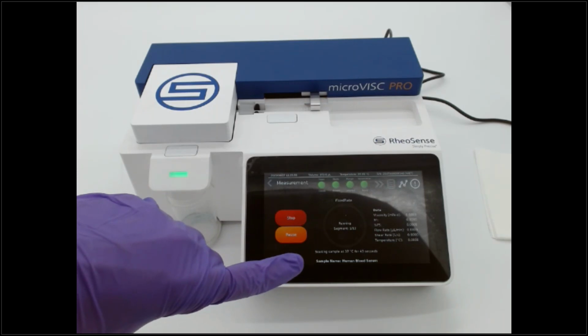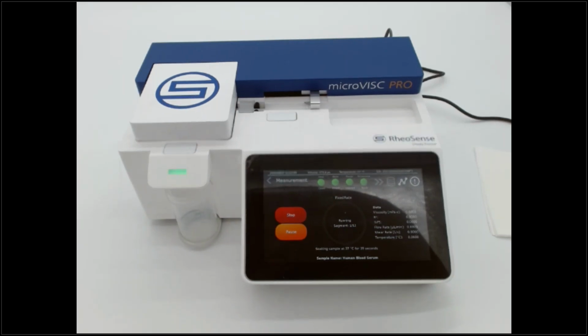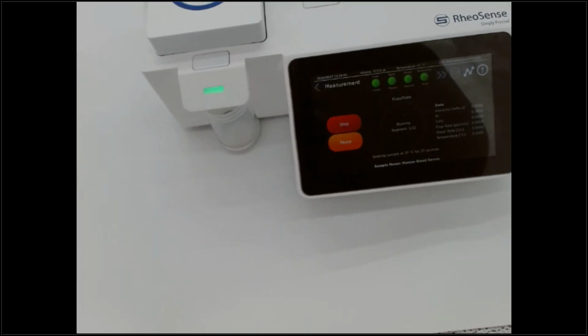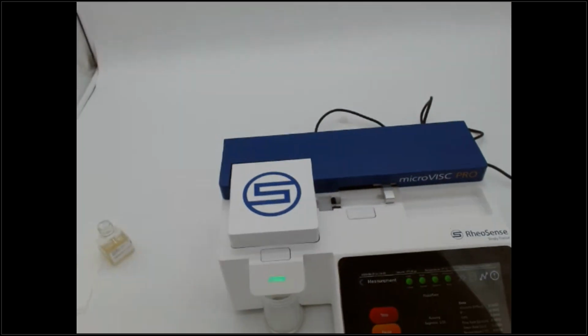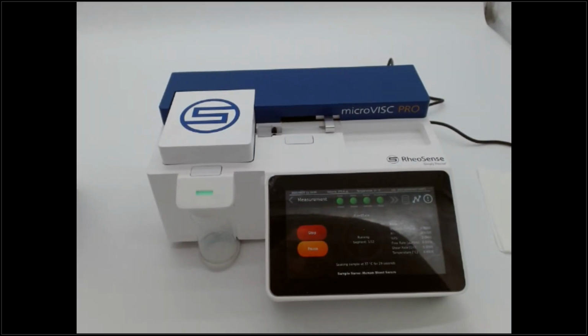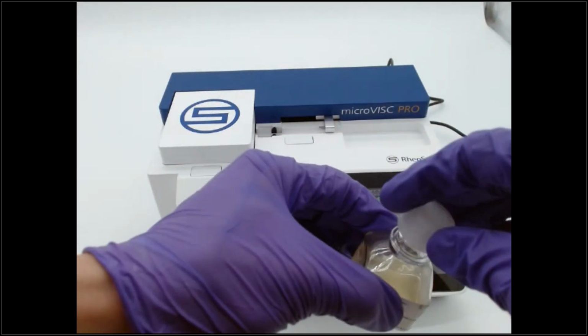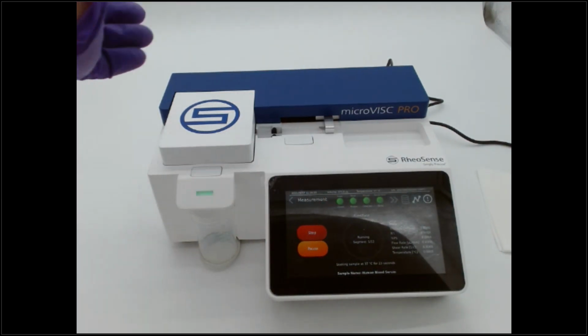So now what it's doing now, perhaps you cannot see very well with this up close here, so I'm going to try to get a little bit more close to the instrument. Let me close the blood serum sample first. I forgot to do that. Perfect. So let's move around.